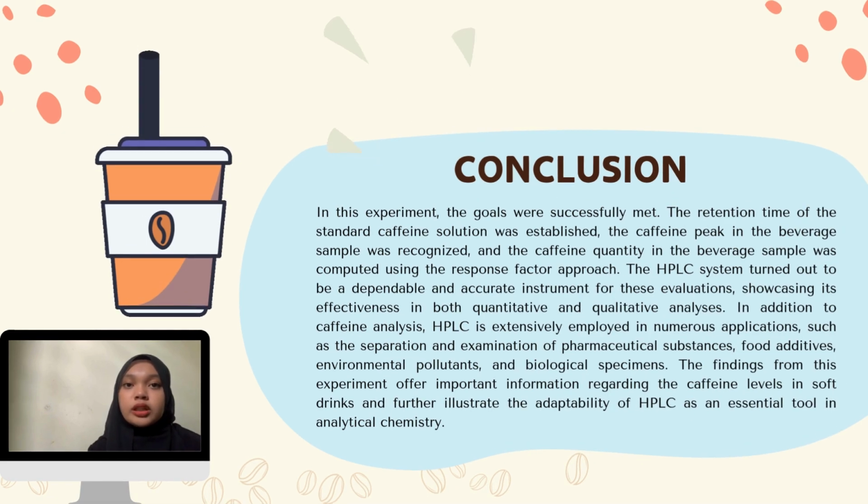In this experiment, the goals were successfully met. The retention time of the standard caffeine solution was established, the caffeine peak in the beverage sample was recognized, and the caffeine quantity in the beverage sample was computed using the response factor approach. The HPLC system turned out to be a dependable and accurate instrument for this evaluation, showcasing its effectiveness in both quantitative and qualitative analysis.